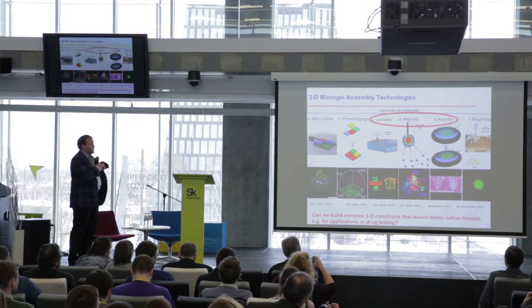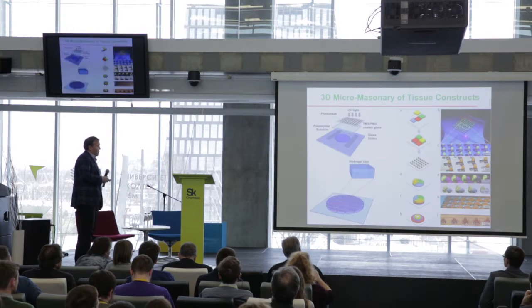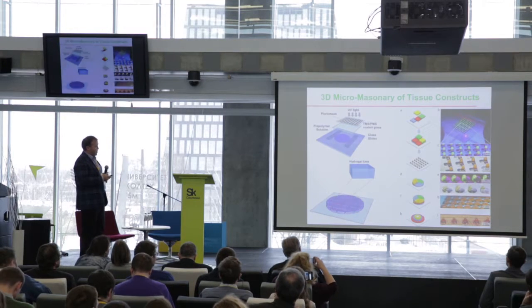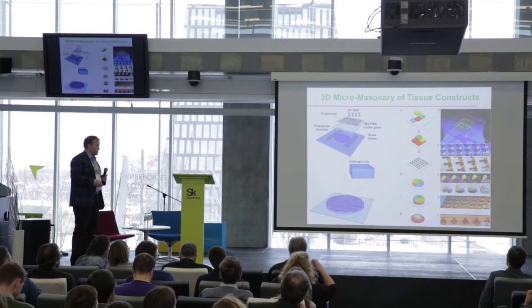The standard bioprinting was where we started mainly. I'll try to go around and discuss these three areas of technologies, but just to give you some background, we usually make micro units of tissue constructs by building masks and using photocross-linkable hydrogels.